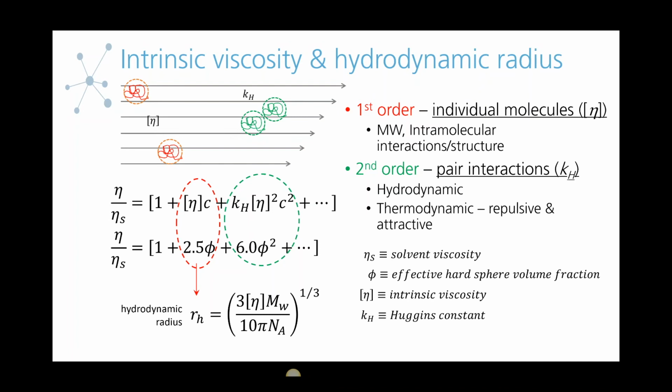And then, of course, we've done measurements on higher concentration systems just to look at how the overall viscosity will vary. The systems we've looked at involve the common additives that you would incorporate into your buffer formulation. So different types of sugars, some of the individual amino acids such as arginine or histidine hydrochloride, and urea, which is expected to be another way of causing the protein to denature. We have looked at different buffer systems to see how changing those would change how the proteins interact and how that reflects in the viscosity, both in the dilute case to estimate the different parameters and in the concentrated regime. We didn't really present that here. That's a little bit separate topic.